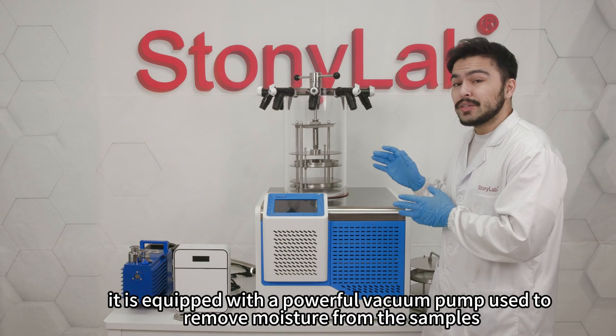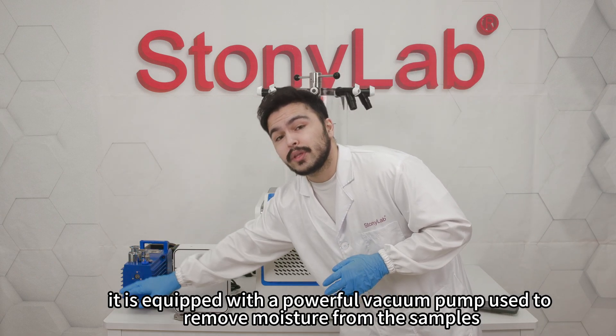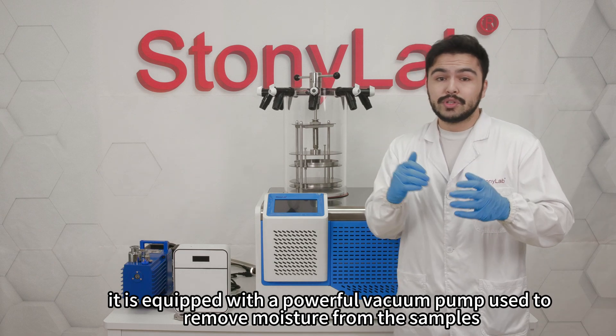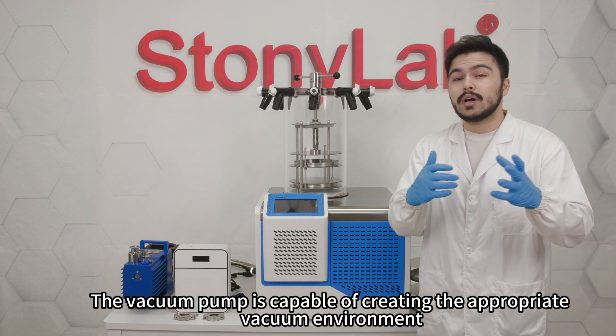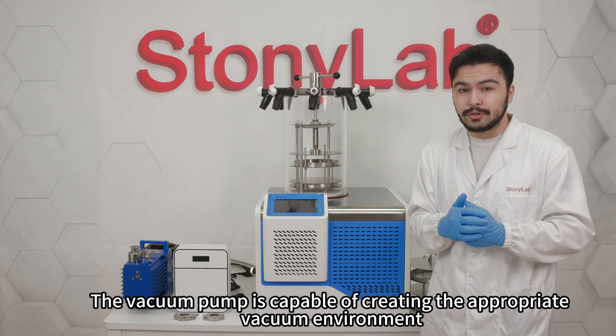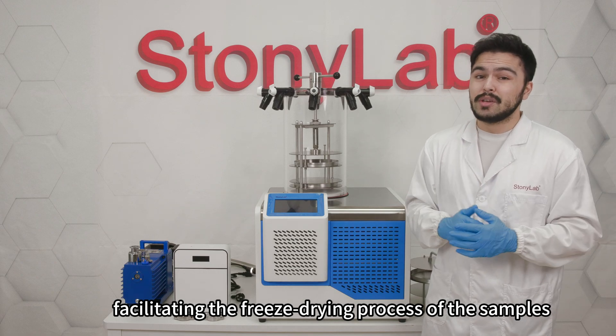More importantly, it is equipped with a powerful vacuum pump used to remove moisture from the samples. The vacuum pump is capable of creating the appropriate vacuum environment, facilitating the freeze drying process of the samples.